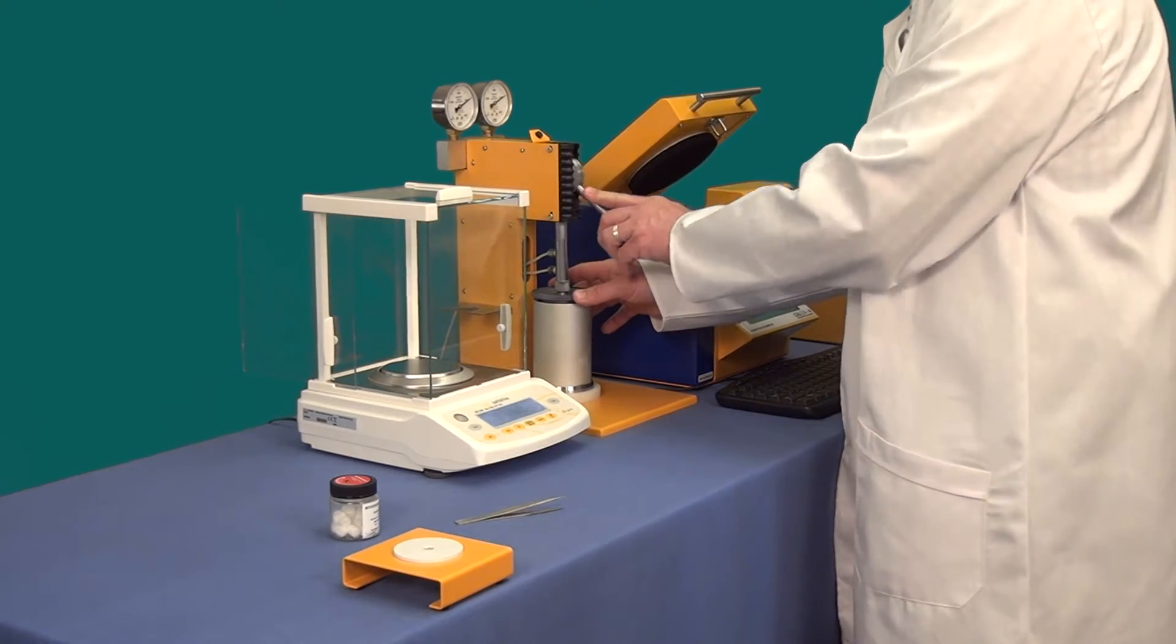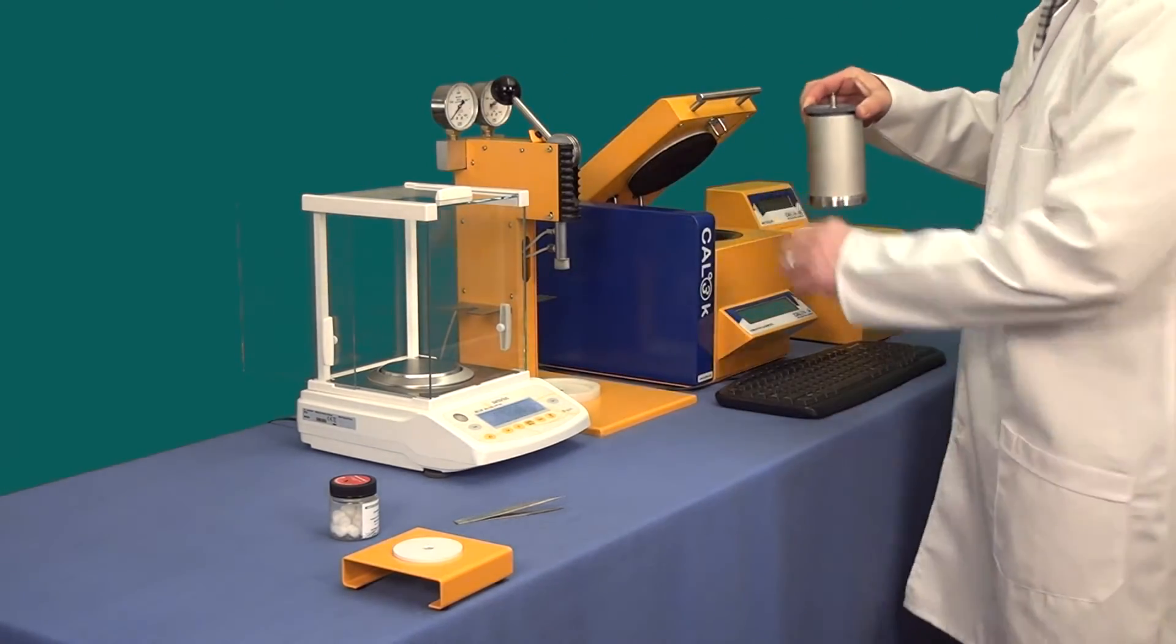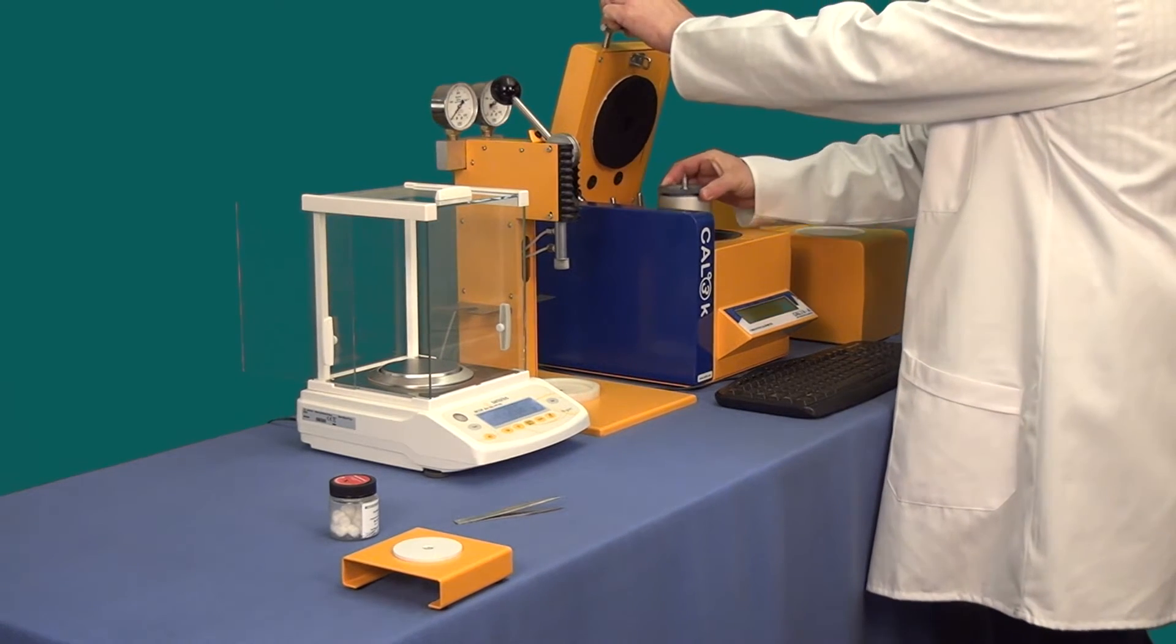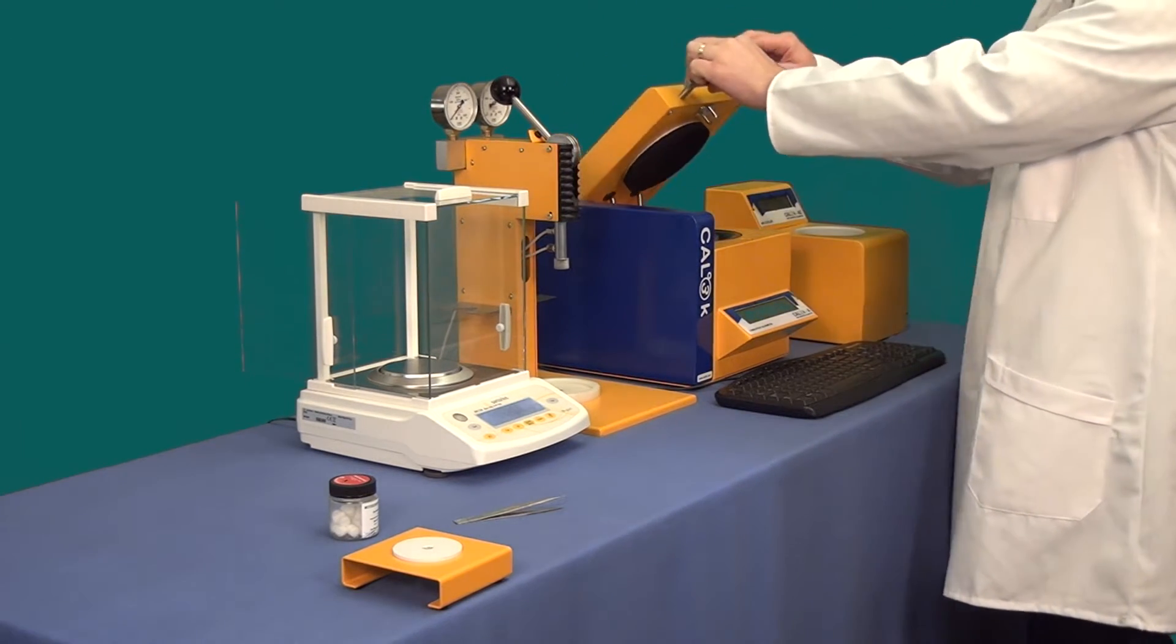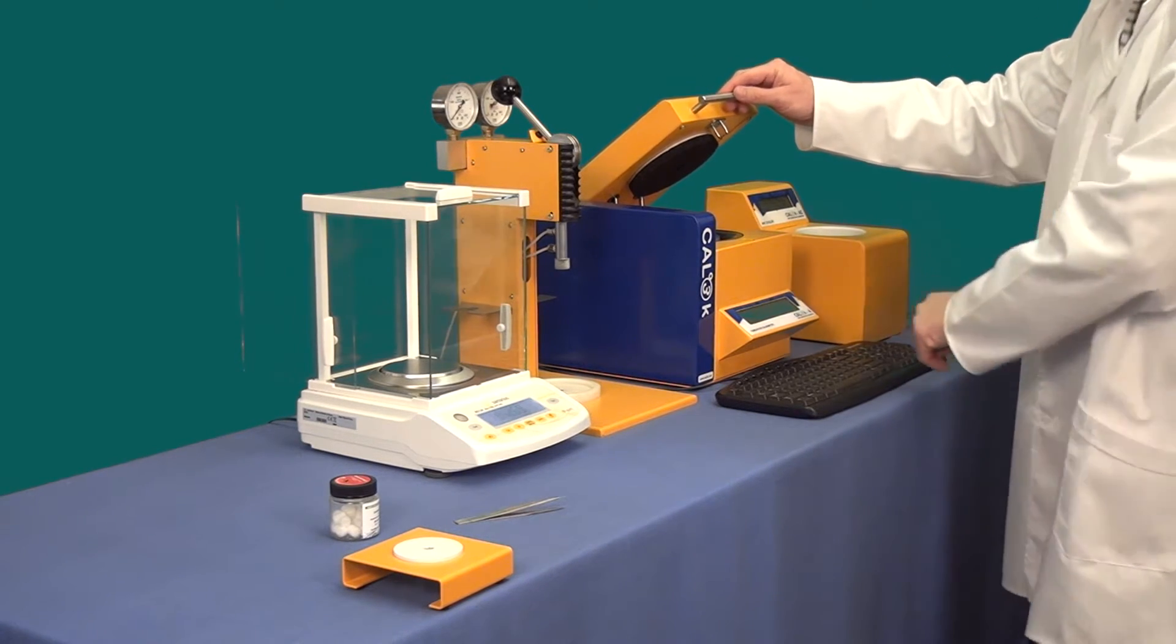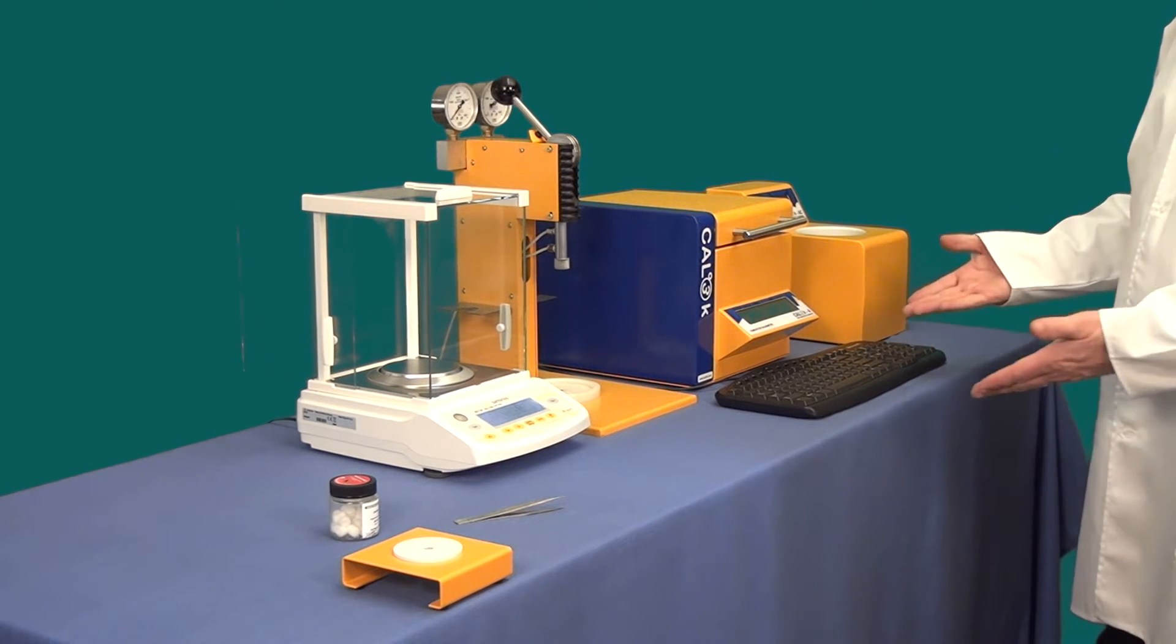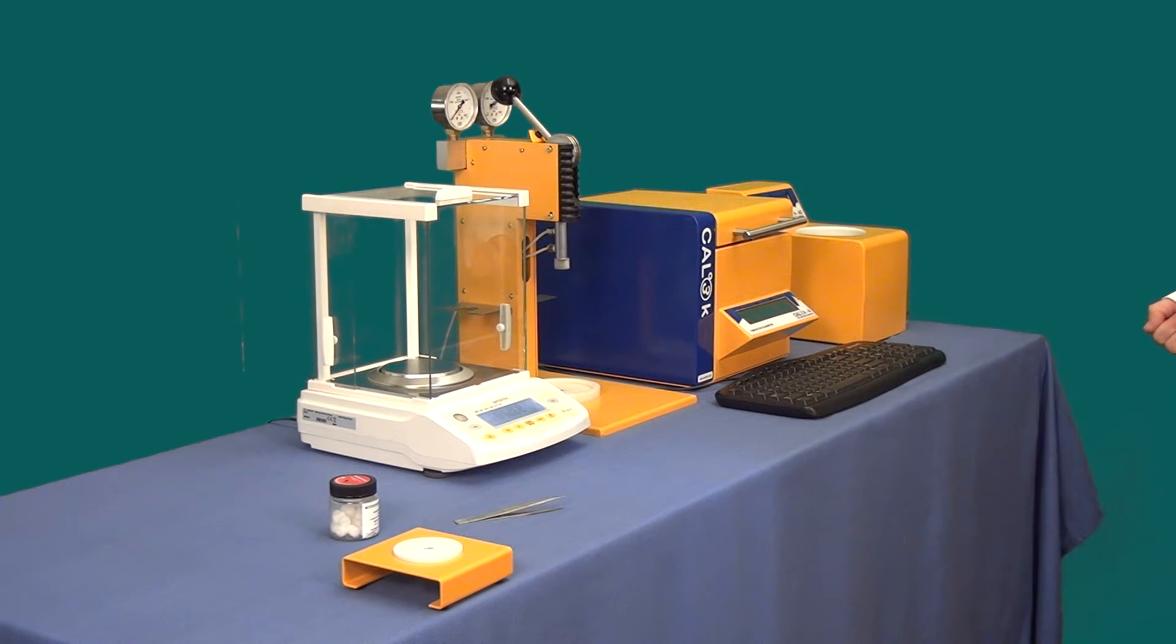Once the bomb is full, release the filling station and place the bomb into the calorimeter well. The calorimeter will give you a message telling you to close and wait. The calorimeter will now do the determination. That's all there is.